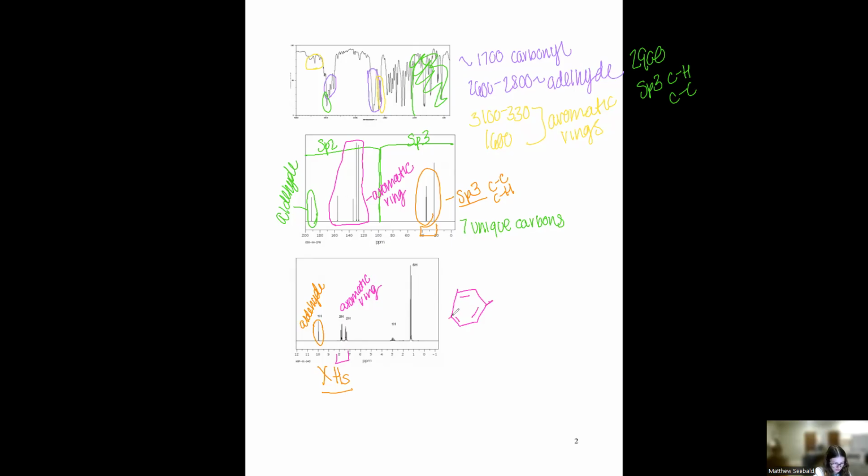What I mean by this is you have your benzene ring, and the substituents have to be symmetrical from each other so that they are directly across. If your substituents were right next to each other, this would give a triplet or a singlet. It would not equal doublet splitting.